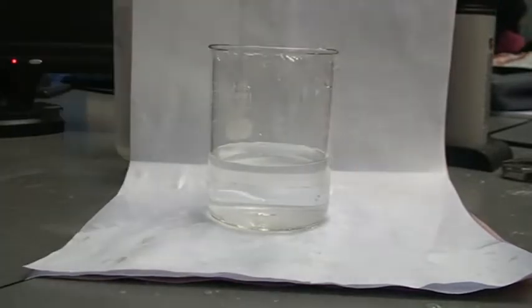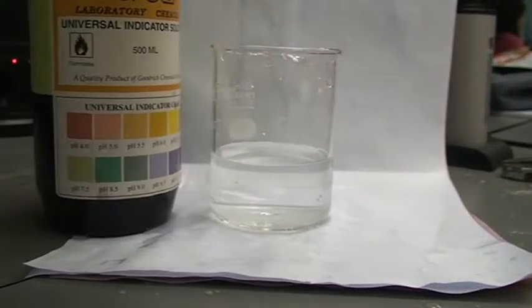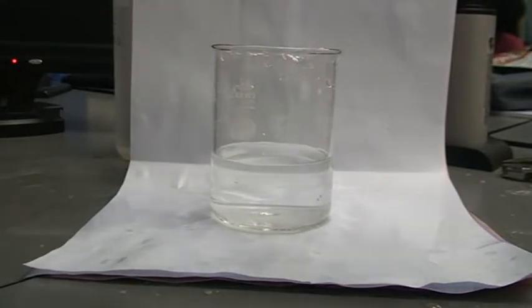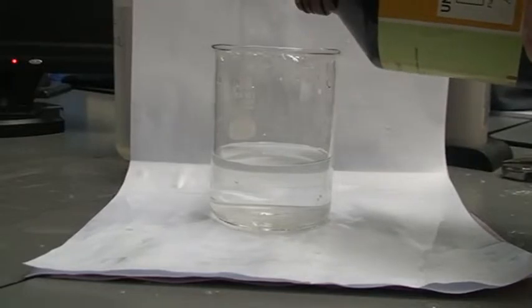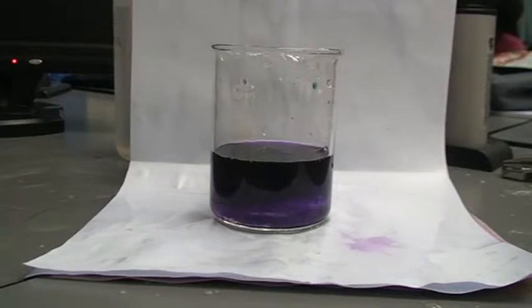So this is saturated lime water. If we put a universal indicator in — as usual, we're going to pour. Can you see that it turns purple? It is quite alkaline.